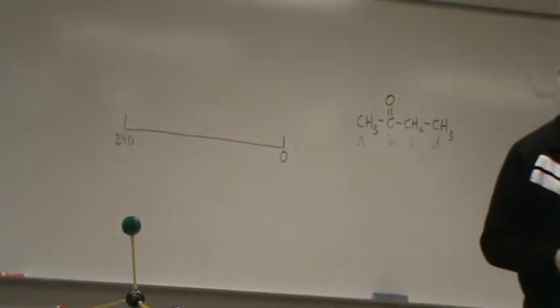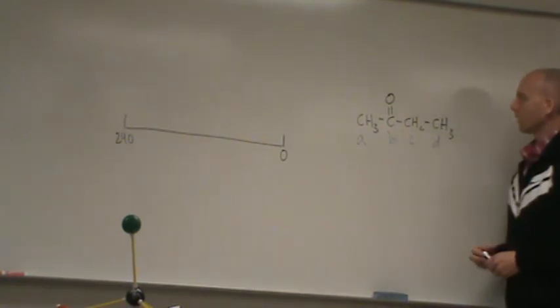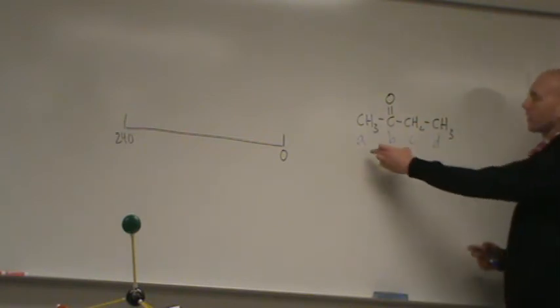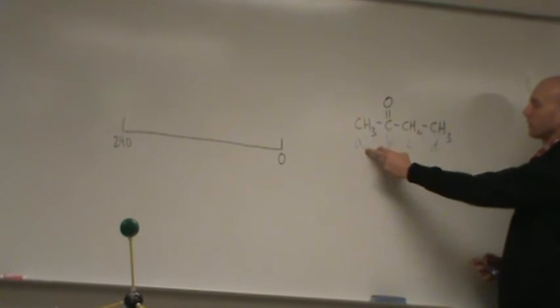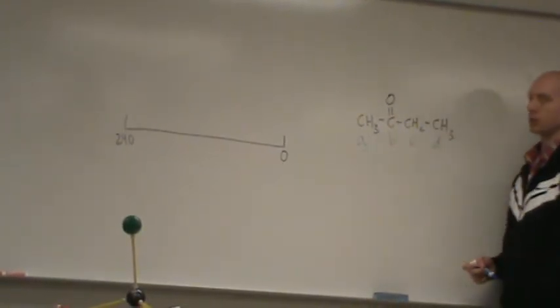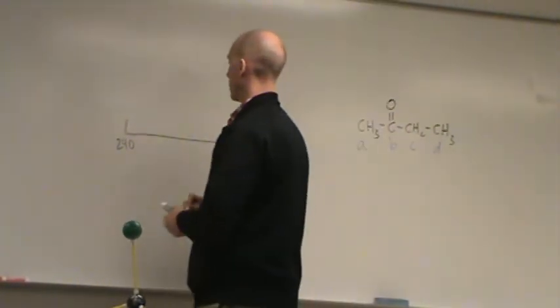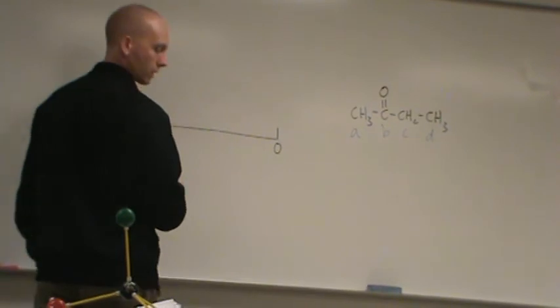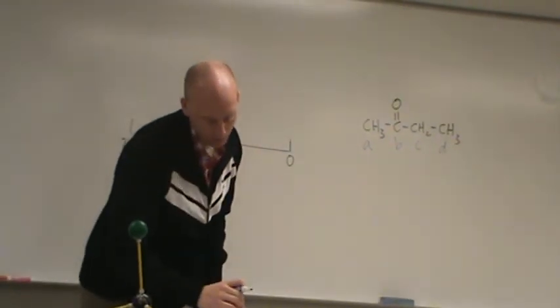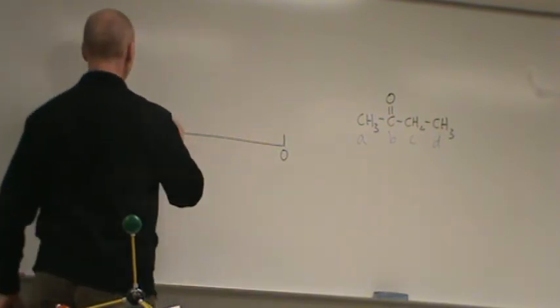Look at the carbon atoms. See, some of you already got tripped up. Which of these carbons should be the most downfield? B. Look at that, right on that oxygen, B is deshielded. And in fact, it is. Here it's showing up at about 210 or so.